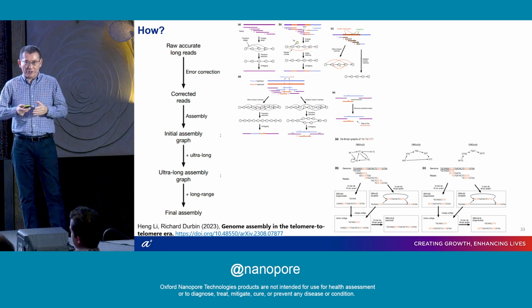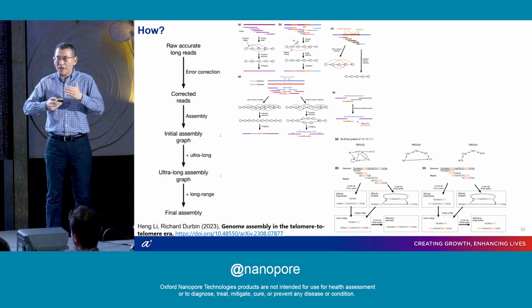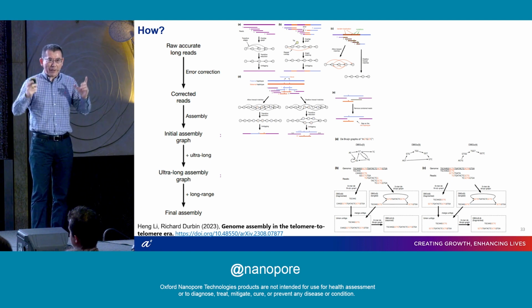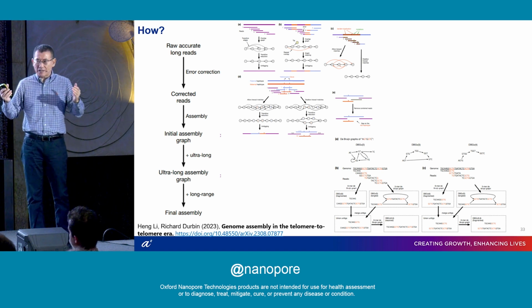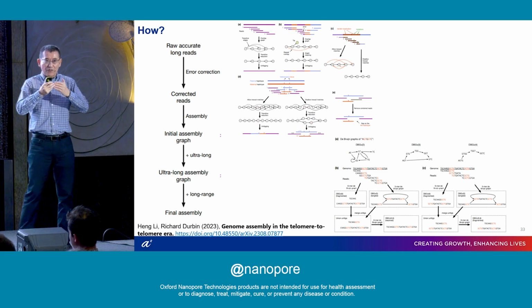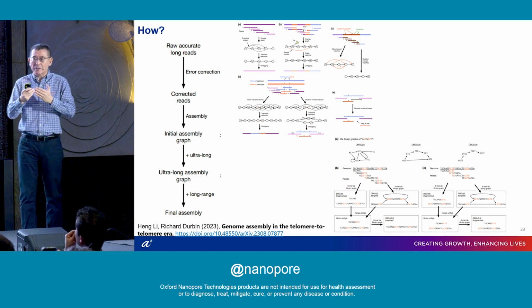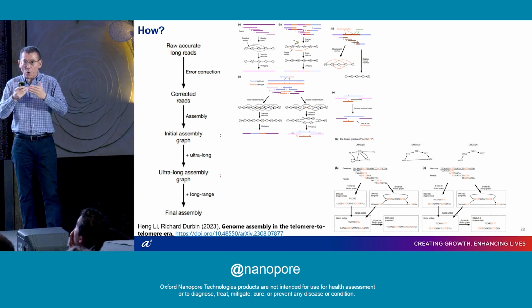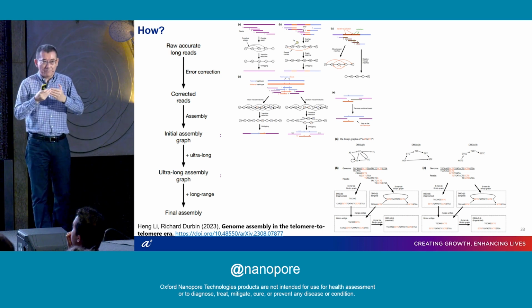All the de novo assembly algorithms always have a step to correct the reads, to clean up the reads before they build this graph. The graph is based on the overlapping information of different reads. They connect reads together and figure out the pairwise connections between all the reads. This can be built on two principles: either using overlapping sequence between two reads, or looking at shared k-mers to build the connection between these reads.